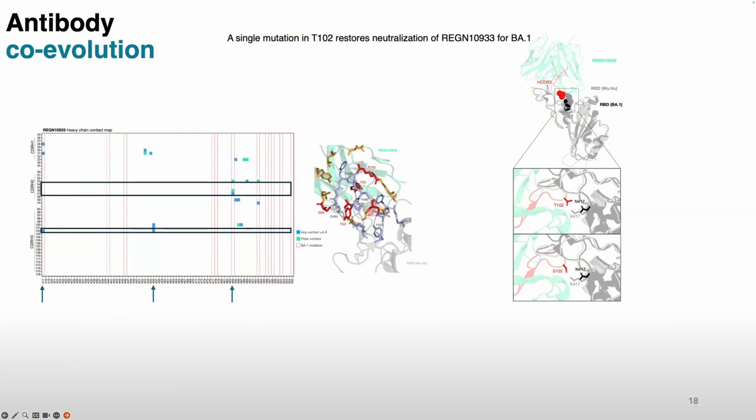What kind of affinity ranges are you pulling out of your optimized libraries? And also, you probably mentioned it and I missed it, what kind of neutralization numbers are you getting? For a particular RBD, are you doing neutralization assays and that kind of thing?